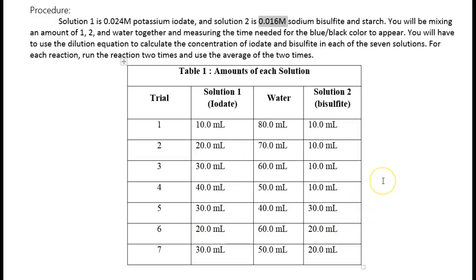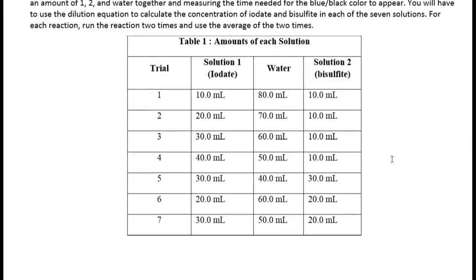And that's going to be important because what that means is when we mix together the two solutions and the water, the total volume, which will help you get the concentration of each solution, the total volume is going to be 100 milliliters. Okay?